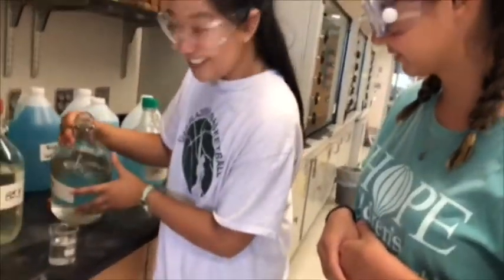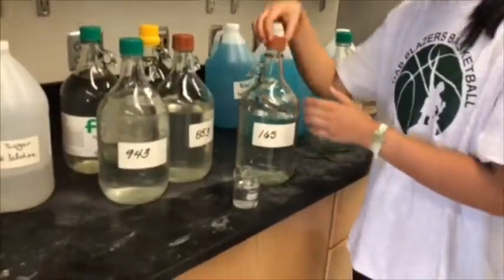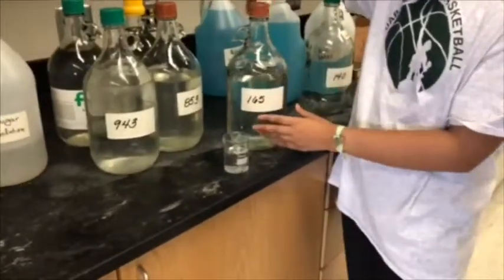For exercise 3, we used the data that we collected in exercise 2 to determine the unknown solution given to us in the lab.